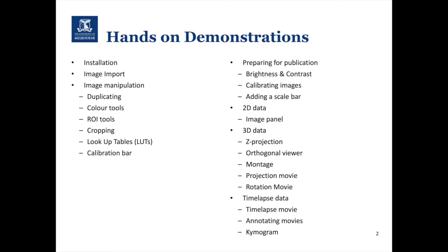Session 2 of the FIJI for Beginners workshop, we're going to cover preparing your image for publication, presentation of 2D data, 3D data, and time-lapse data.